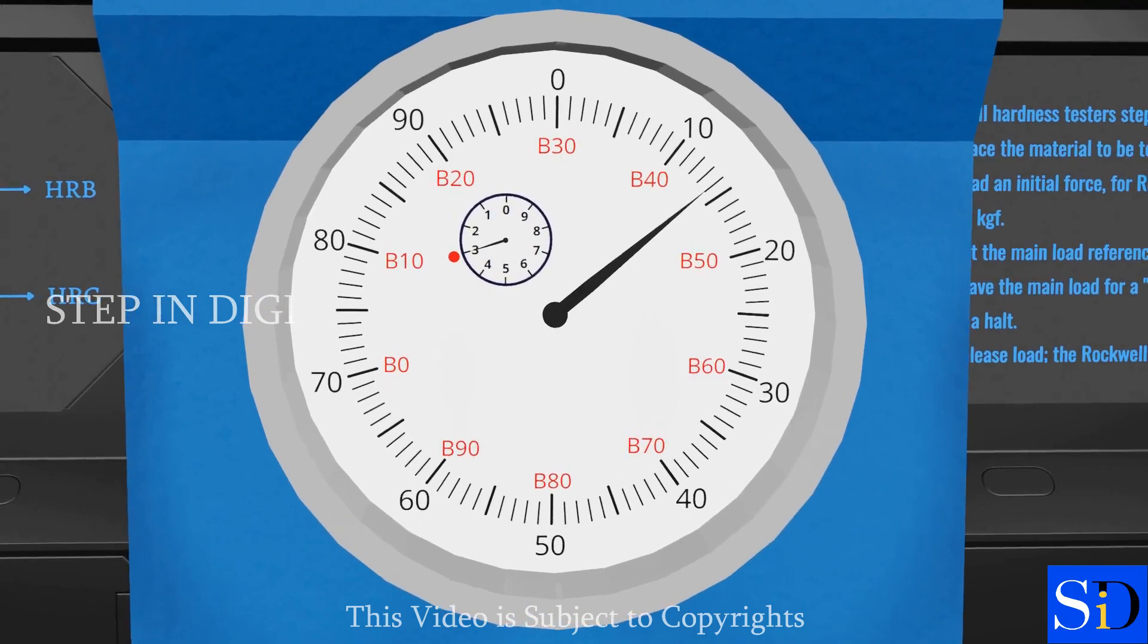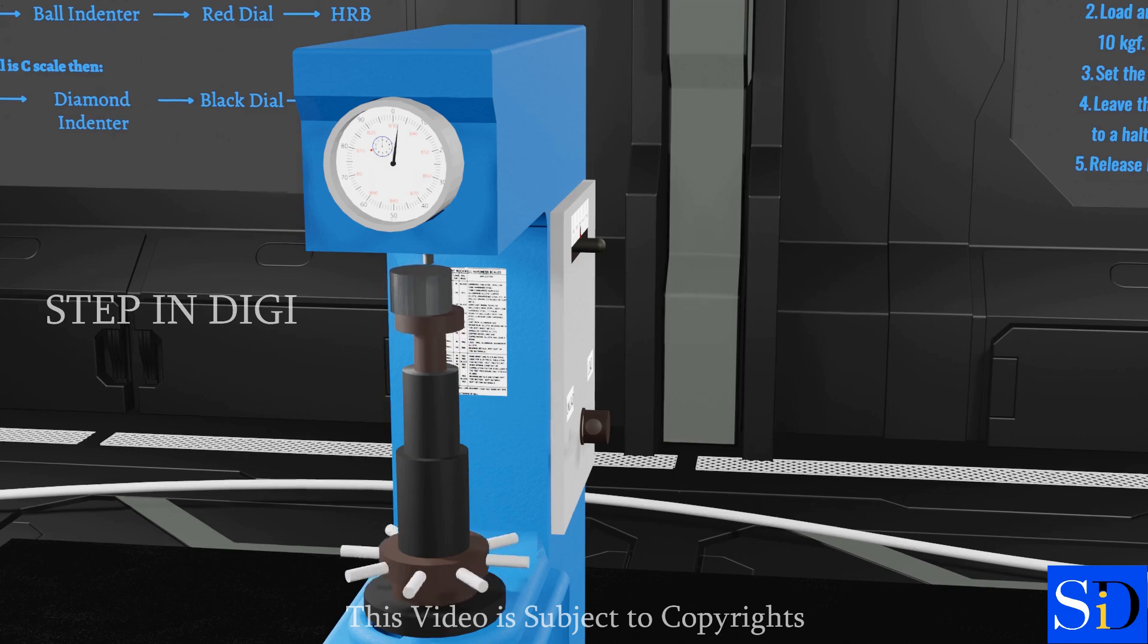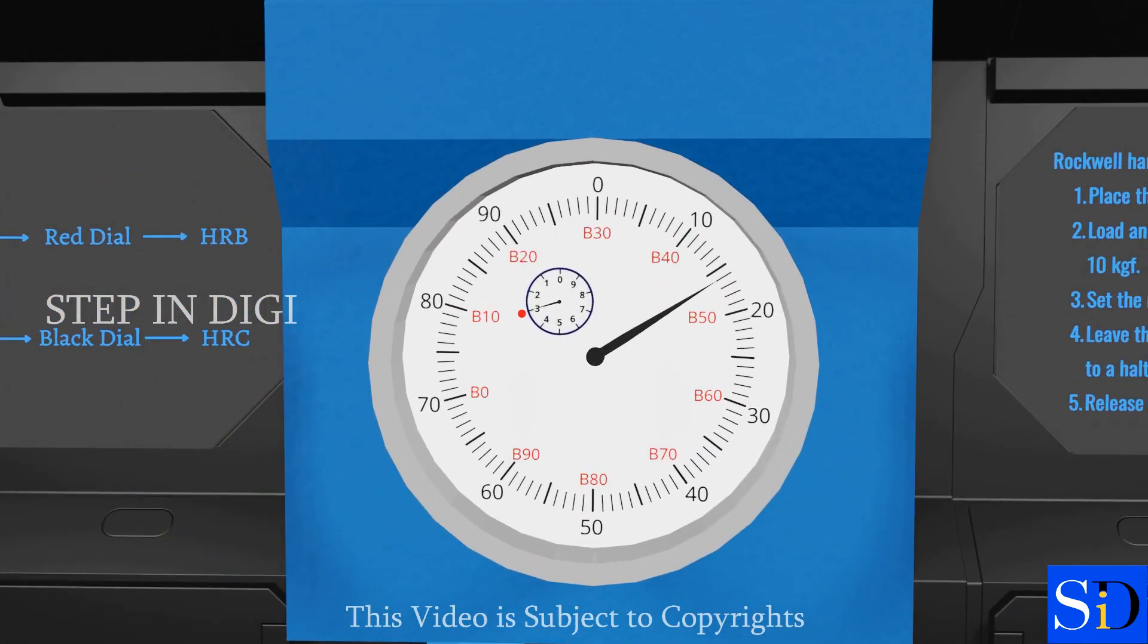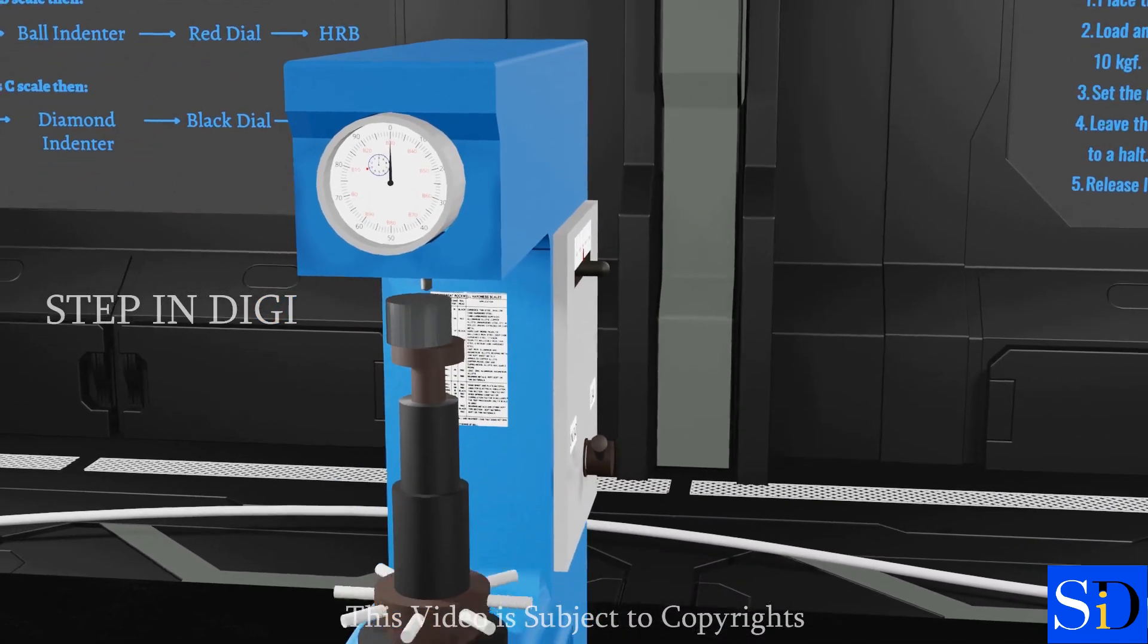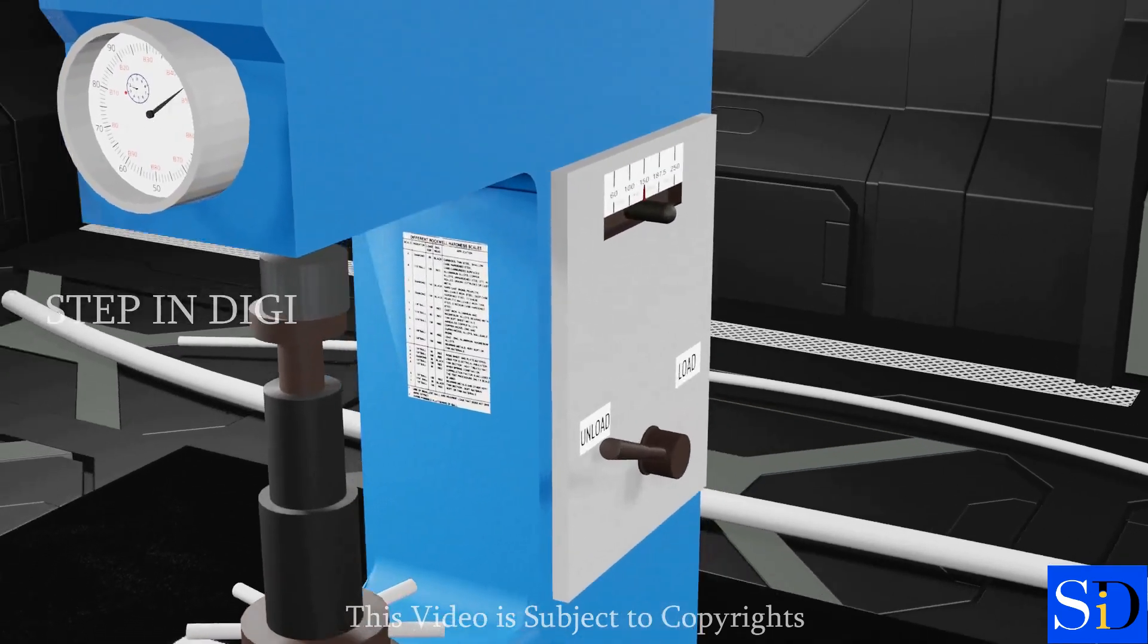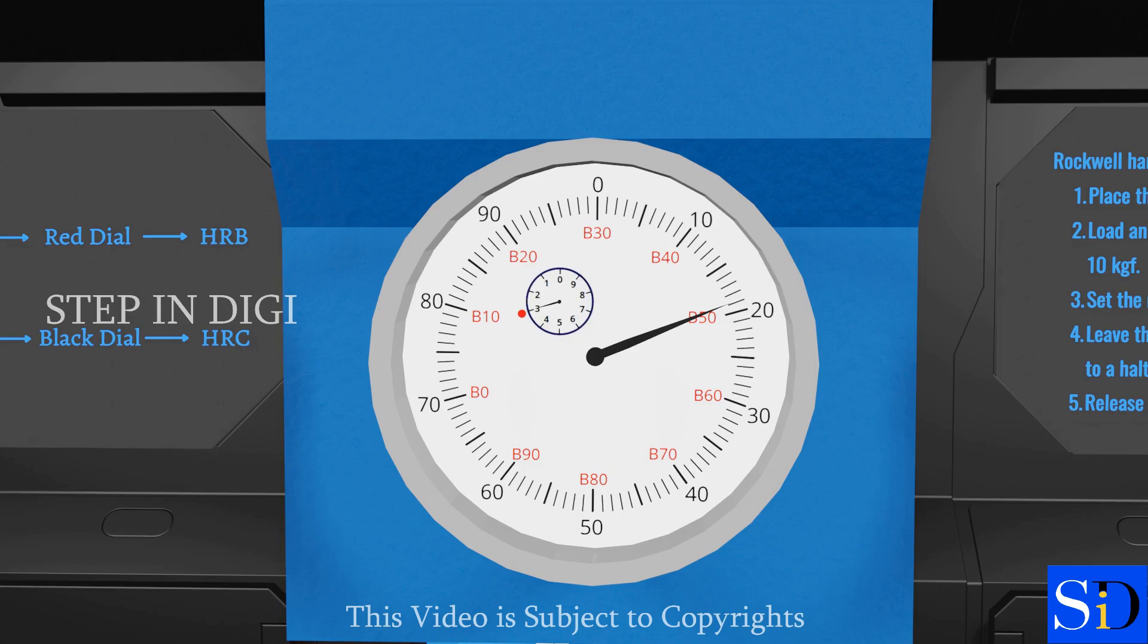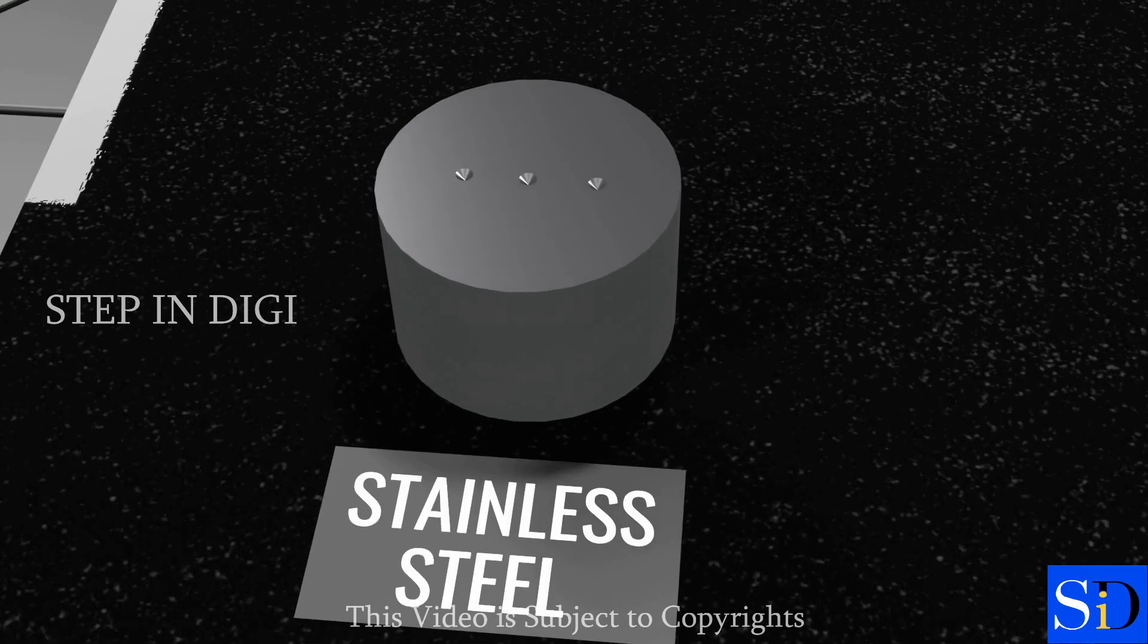Now, let us take two more trials for the same test piece. The dial shows the second trial reading as 16. The third trial reading as 19 is shown on the dial. Now, we can clearly see the cone-shaped indentation formed on the surface of the test piece.